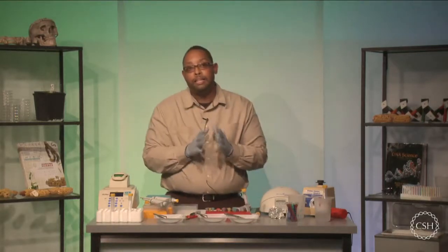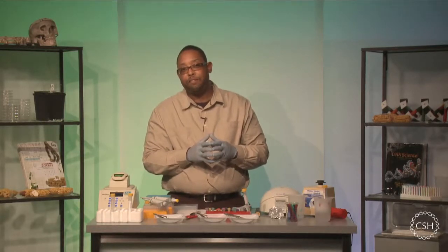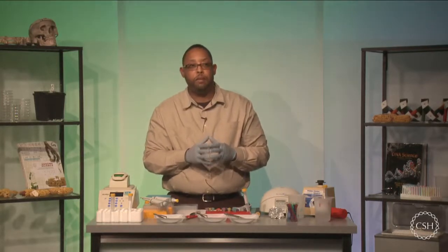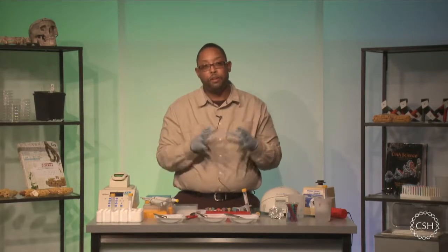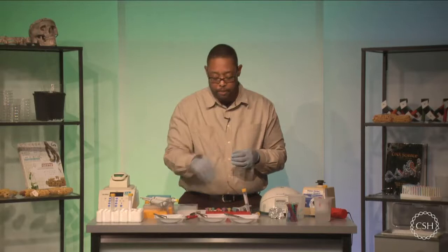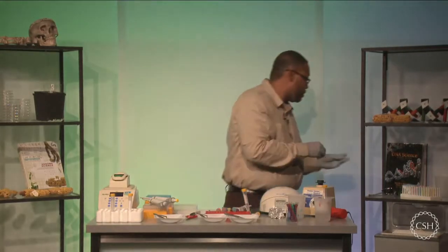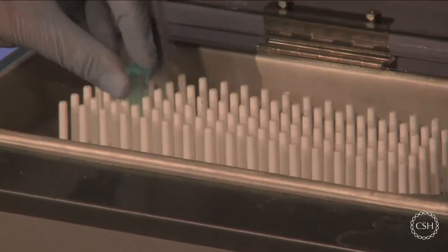Now, at this time, you're going to put your samples to incubate at 65 degrees Celsius for about 10 minutes. This is going to allow further lysis of all the membranous material so that we can extract more DNA. So I'm going to take my samples at this time and put them into my water bath.